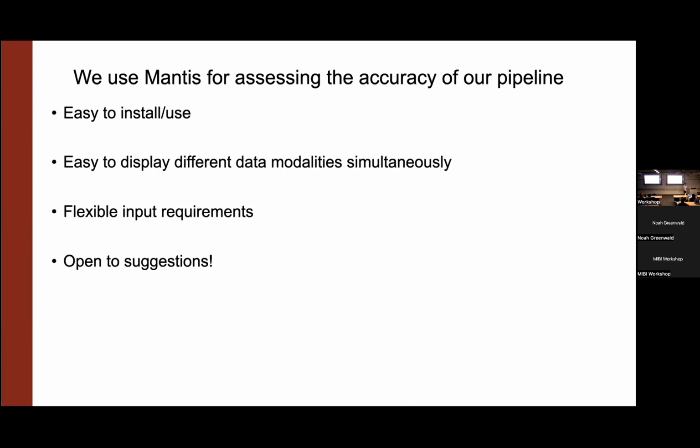And it doesn't have very specific data formats. The formats are a TIFF and a CSV. So anyone can format their data that way. It really doesn't require a lot of wrangling. And the Mantis team is extremely welcoming of suggestions.